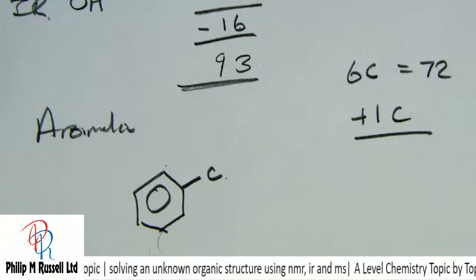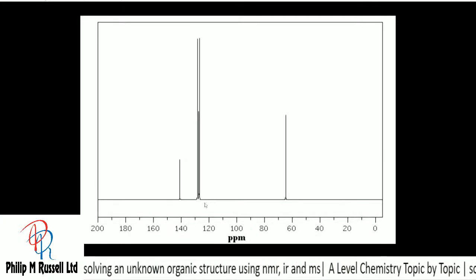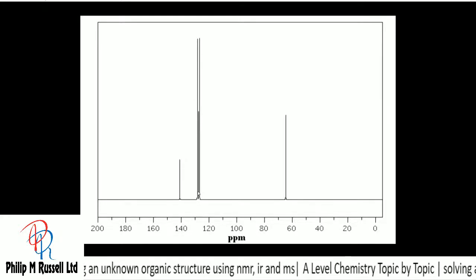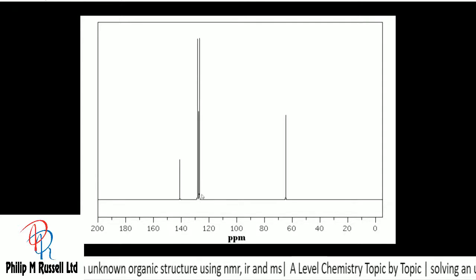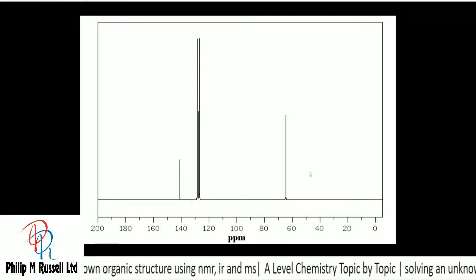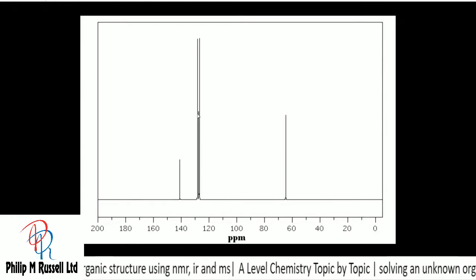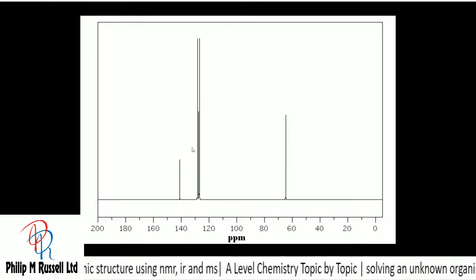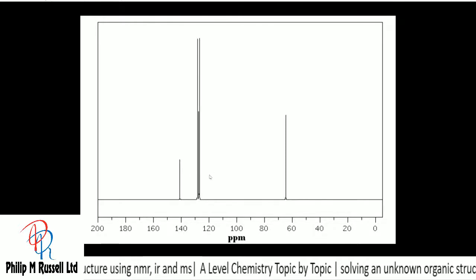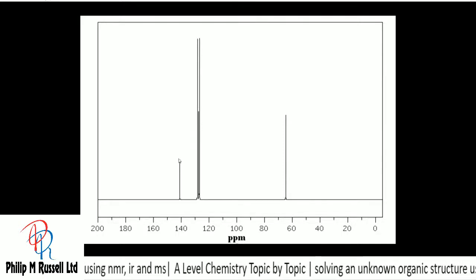Well, let's quickly pop over to the carbon just to check. Oh look, there's your signal about which are your aromatic carbons. But you have got these other 2, and there, I reckon, is your single carbon on its own because it's so far down. I reckon it's carbon number 1, 2, 3 there, and the 4th one there, and that 4th one is probably the one with the OH. This is where the symmetry of the benzene ring takes place where you've only got 3. So somewhere down the line there's an OH.